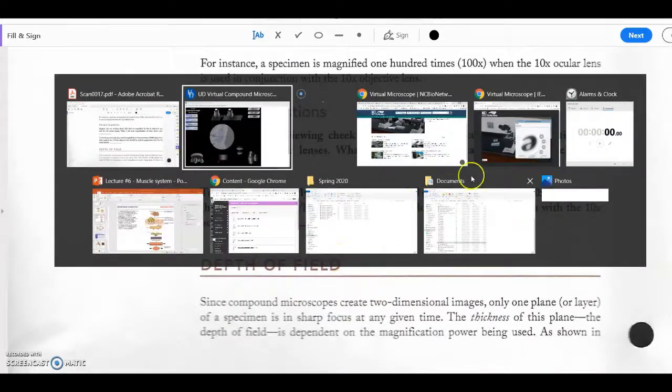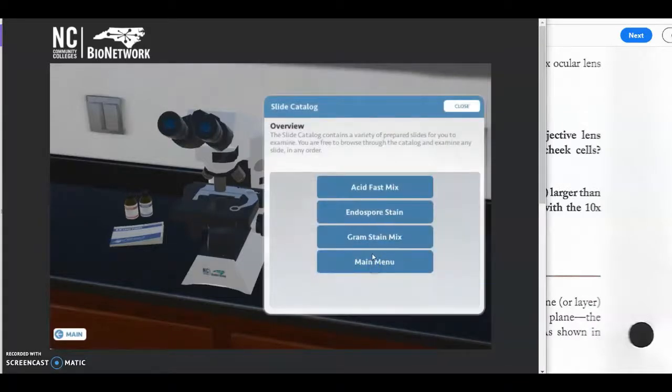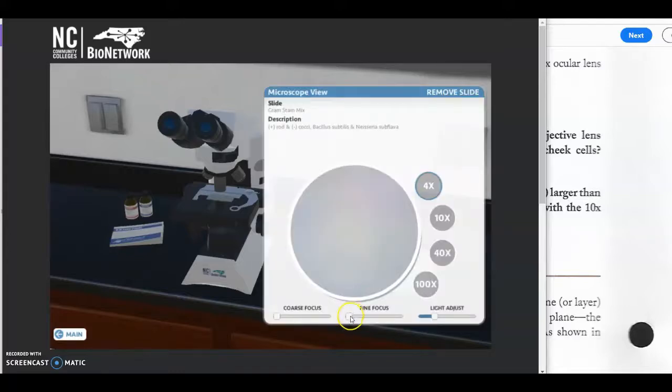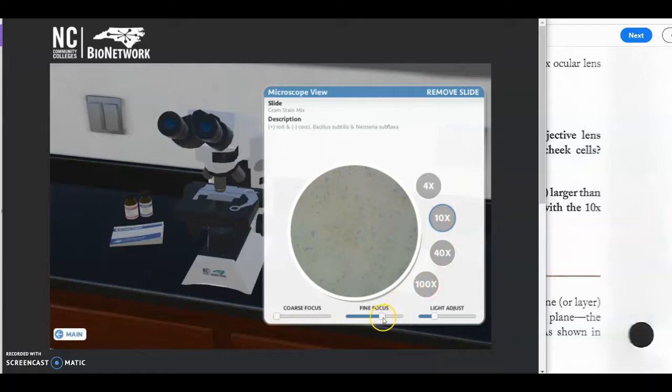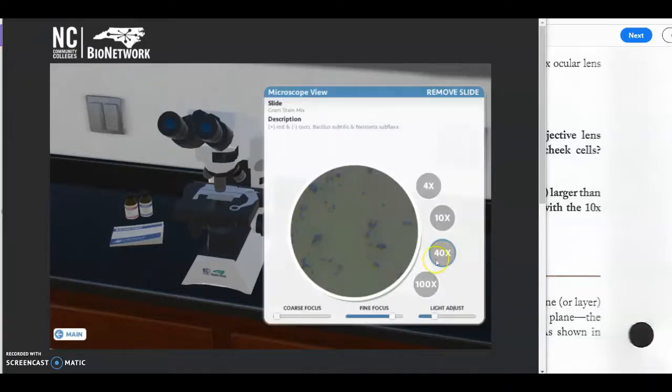Now, what about bacteria? Let's take a look at bacteria. We can do it. So we're going to do gram stain. You can see a lot of dots, so let's see if we can turn the objective to 10x and see something. No, not really. I mean, we can see stuff, but it's not very clear. Now, here we can see at 40x objective lenses, it's much better. You can kind of appreciate different microorganisms, but still it's not good enough.